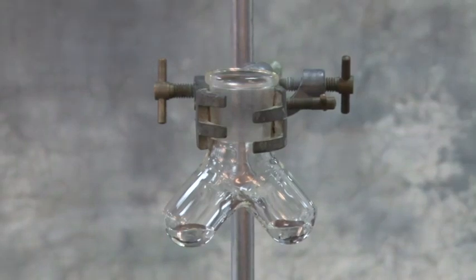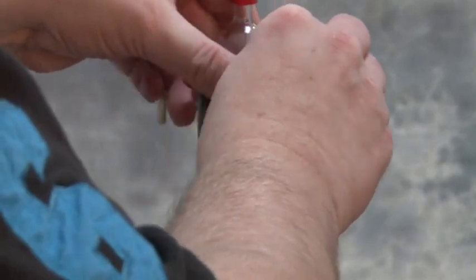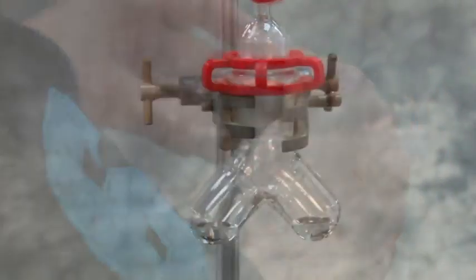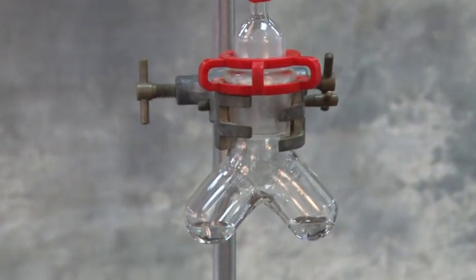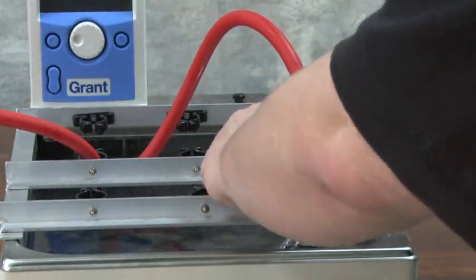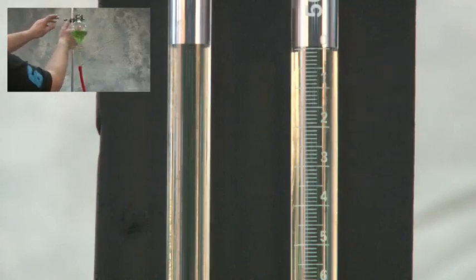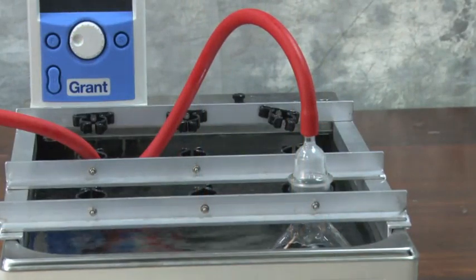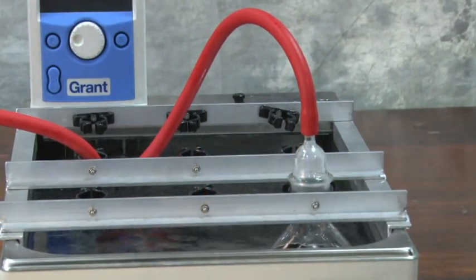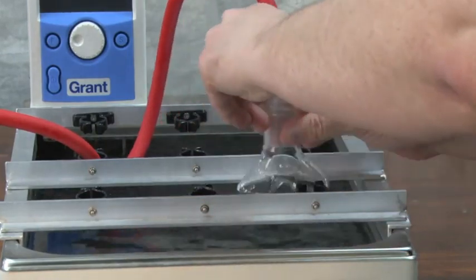So now we're going to connect this reaction vessel to the gas burette. We're going to clamp this on very carefully and tightly because we don't want any gas to be lost from the chamber. And now we're going to put it into the water bath, which we remember was at 35 degrees centigrade. And we're going to adjust the levels with the reservoir so that we've got zero on the volume. We're going to now wait some time until the reactant and the catalyst are all at the temperature of 35 degrees centigrade.